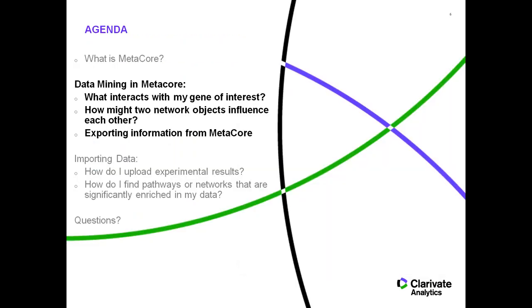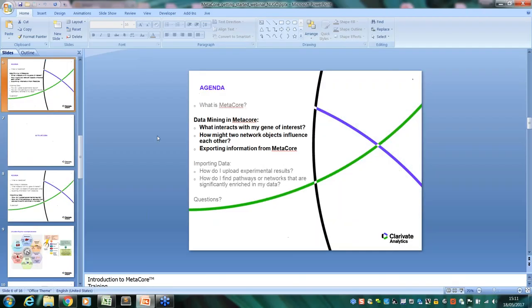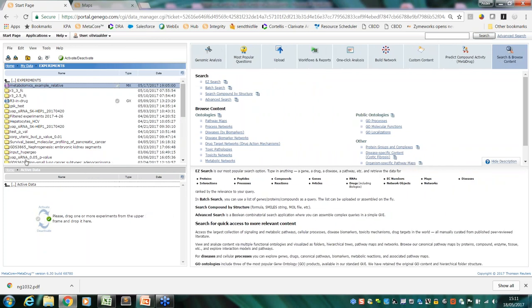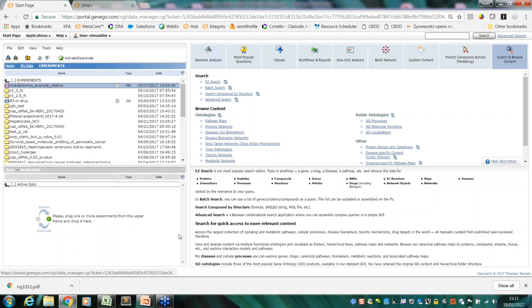I'm going to jump into it live to show you how you can interact with it, how you can use it. So once you've logged into MetaCore, this is the page that you'll see. It's basically divided into four panels. All your tools are over here on the right, and this is where your uploaded datasets will live.